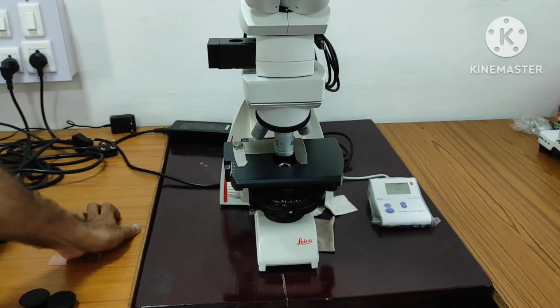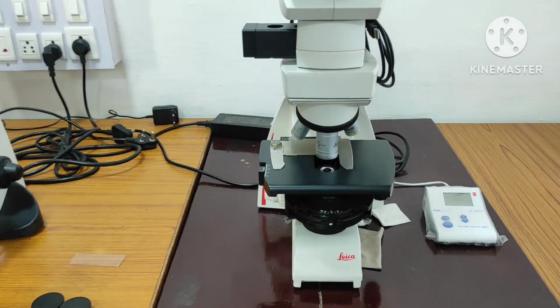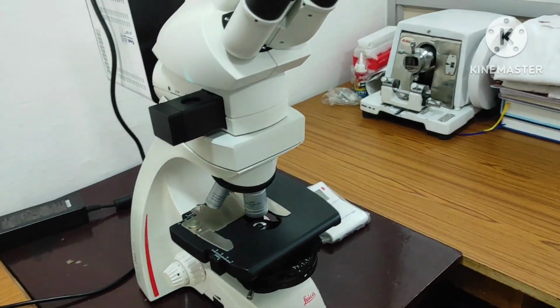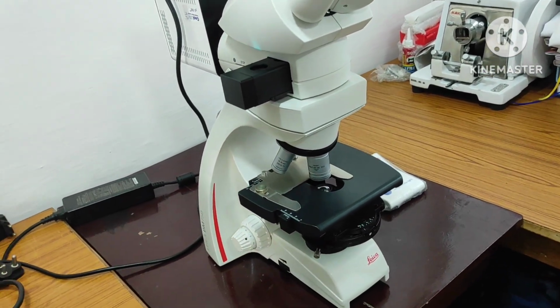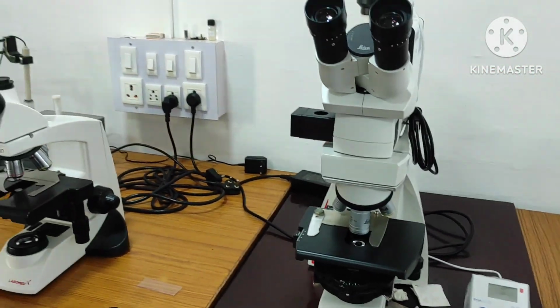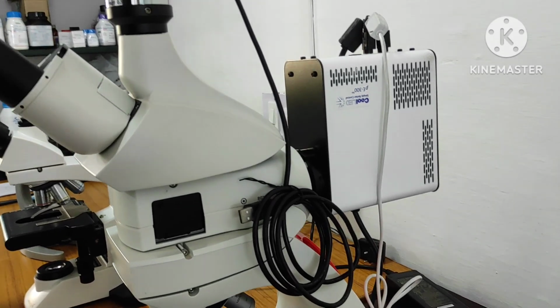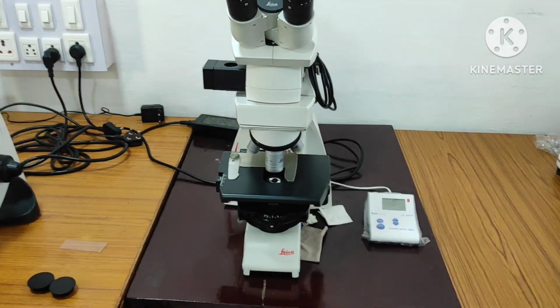Here we can see 2-3 extra facilities are present. This is called a phase contrast microscope. As well as with the compound microscope, we have fluorescence facilities also here. So it is also called a fluorescent microscope, phase contrast microscope, right. Basic things are almost the same only, advanced things are different, right.